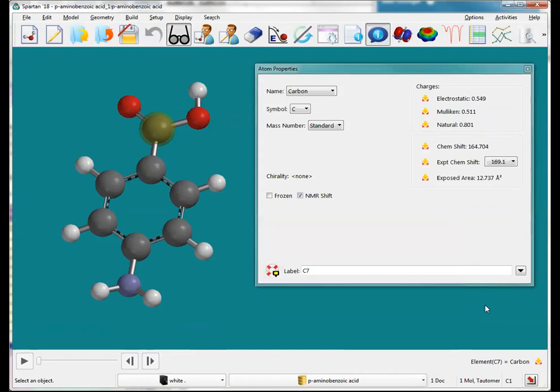Spartan has run through 4 different iterations of analysis as far as NMR spectra are concerned. The first thing we did when we had this ability to calculate shifts from the QChem package was do a big, large assessment. And it turns out that raw, unaided chemical shifts, at least for carbon, are on the error of plus or minus maybe 4 to 5 ppm. So not terribly useful as far as an aid in assignments are concerned.